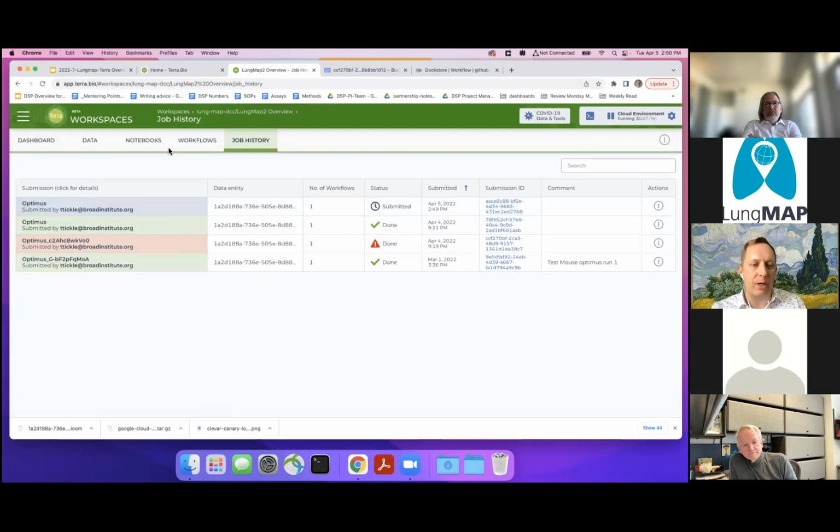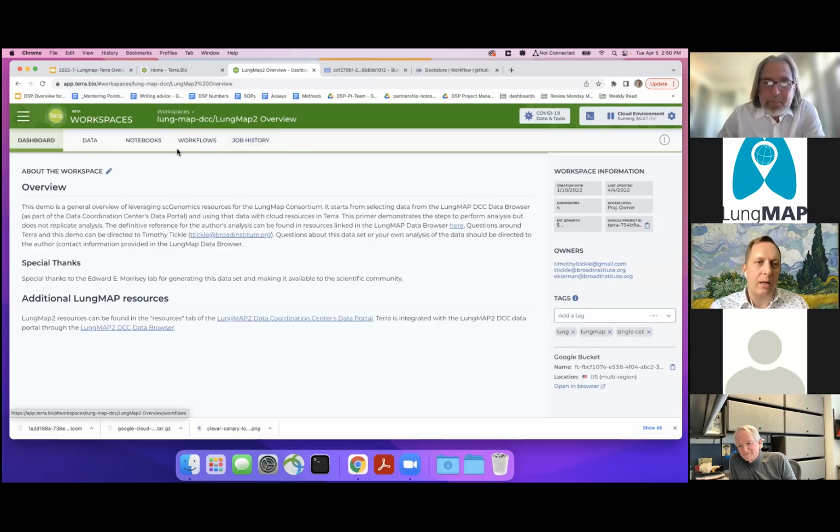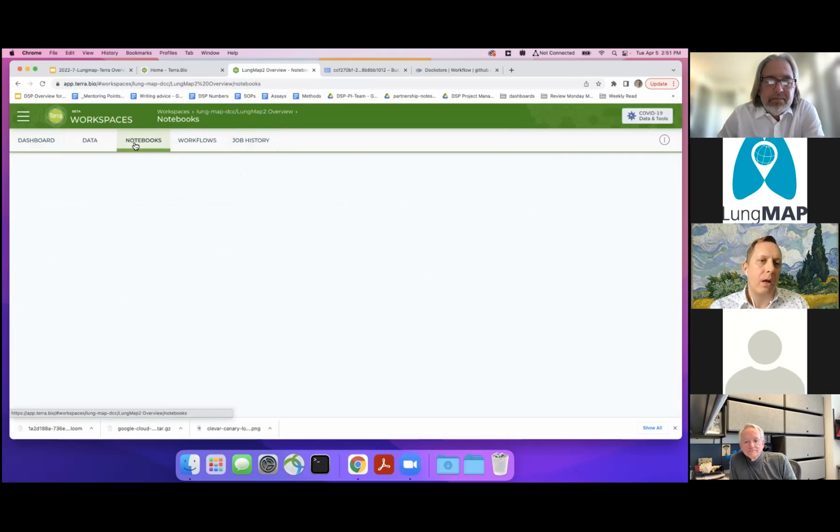But in the spirit of a great baking show, I'm going to move forward and grab something that's pre-cooked. All right. So workflows. So we talked about workflows, and this is now what it looks like with the environment running, for instance. So now the notebook.